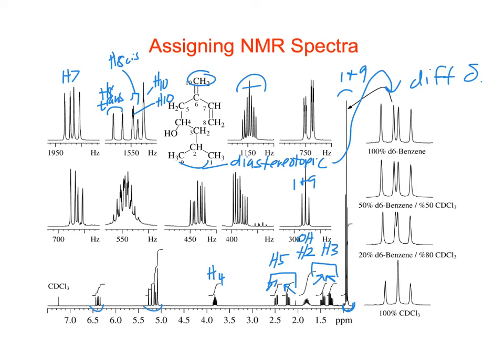You're looking kind of blank there, Stephen. The beta diketones, when they look like that. Uh-huh. So I'm trying to look at my products from the photodegradation because I have a lot of things that look like this. And then there are things that look like triplets that I don't think are triplets, but I don't know how to explain it. But now this throws a huge wrench in that because I have no idea how to interpret it myself. I'm not really sure what to do at this point. Yeah.